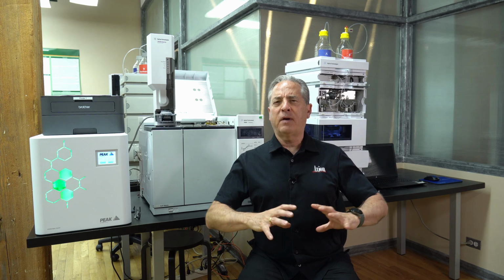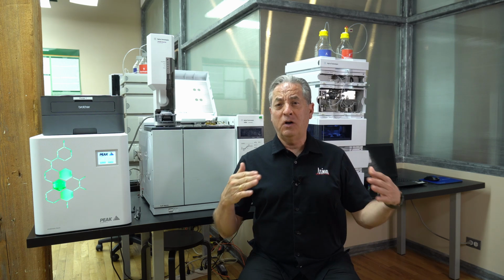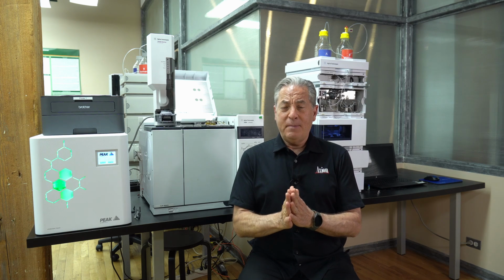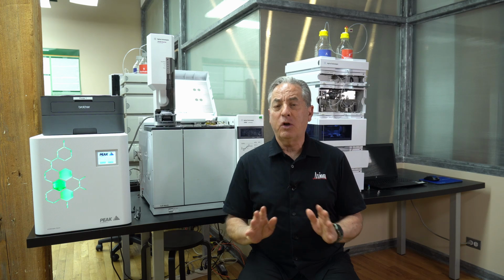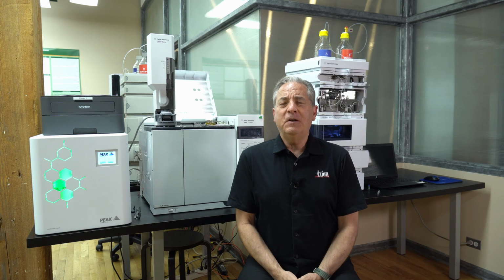If you have a pharmaceutical facility that is manufacturing, it's called CGMP, good manufacturing practice. Underneath that, if you have a laboratory working there, you must have GLP, good laboratory practice, which means you have a method, and you cannot change one single thing. You cannot change temperature by 1 degree, because the method has gone through validation. So the question is, what is validation?